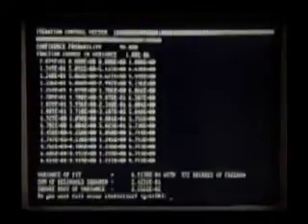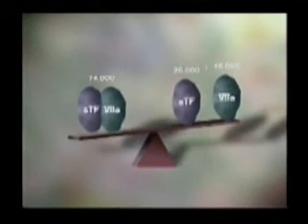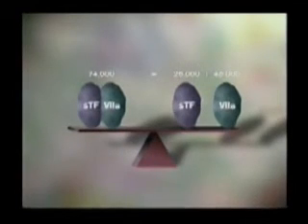Our model was correct, so we are able to calculate an average molecular weight of 74,000 for the samples of mixed STF and 7A. Note that this is the same as the sum of the molecular weights of one 7A molecule and one STF. So we conclude that complexes were formed between 7A and STF, and that the 2 molecules associate in a simple 1-to-1 relationship to make the complex STF-7A.